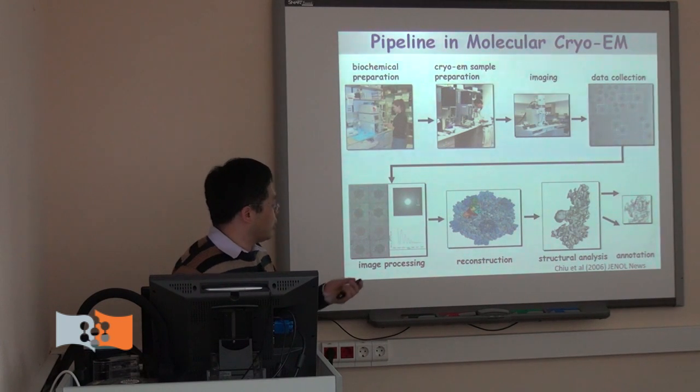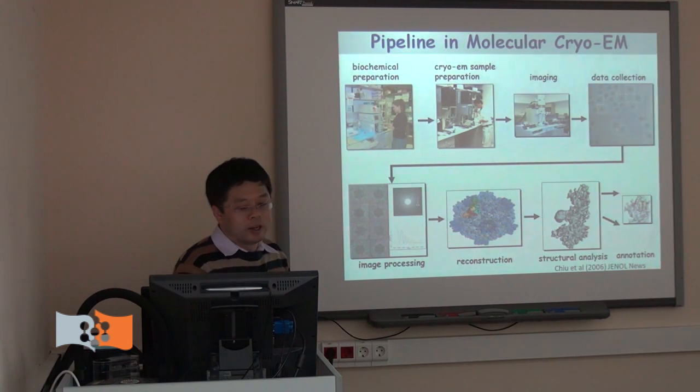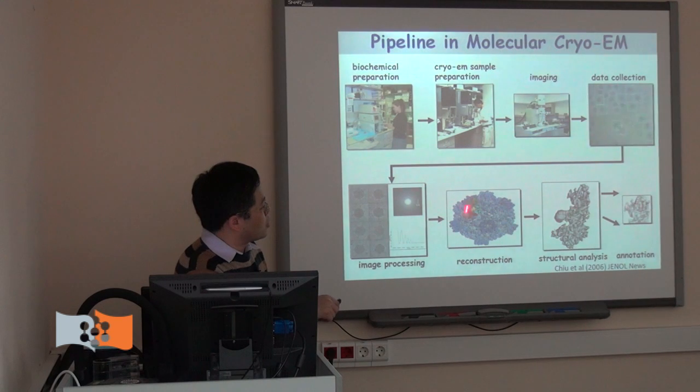But recently, there has been a lot of development in the cryo-EM field. The resolution of EM reconstruction is getting higher and higher. Getting to the 3 or 4 angstrom resolution area is what we actually achieve in my lab, and other labs in this field also achieve this kind of resolution for some typical icosahedral viruses like this one.